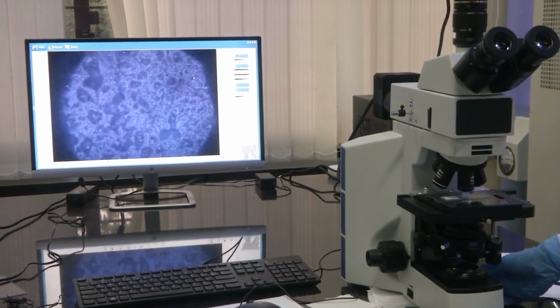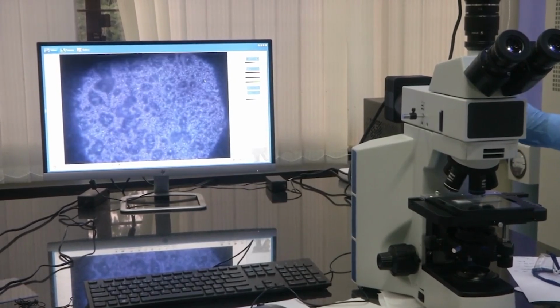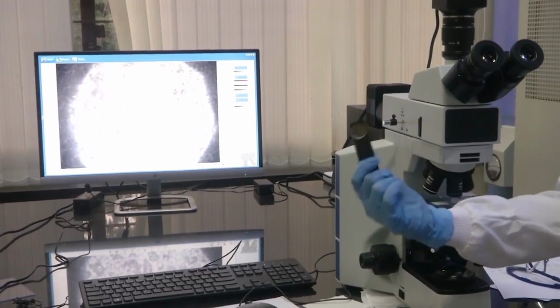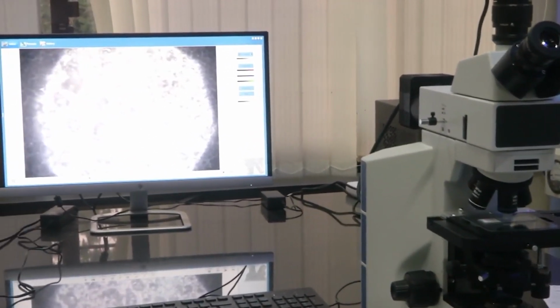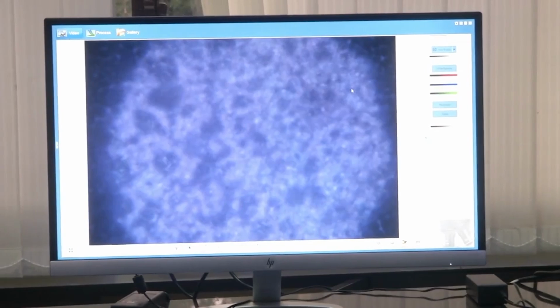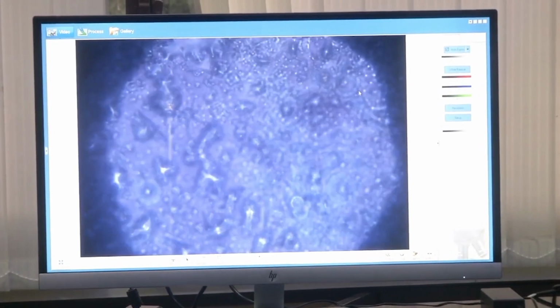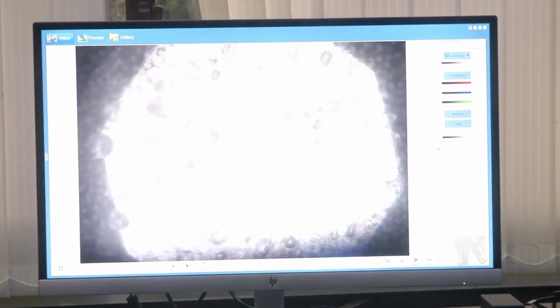So, that time, see, the image seen is slightly different, because we have used a blue filter. Let us say I remove the blue filter, you will get white color. So, I have removed the blue filter we had kept. Let me put it back, then you will see that image has become blue. And you are seeing a circular image, right? That is because you have put a circular filter like this.